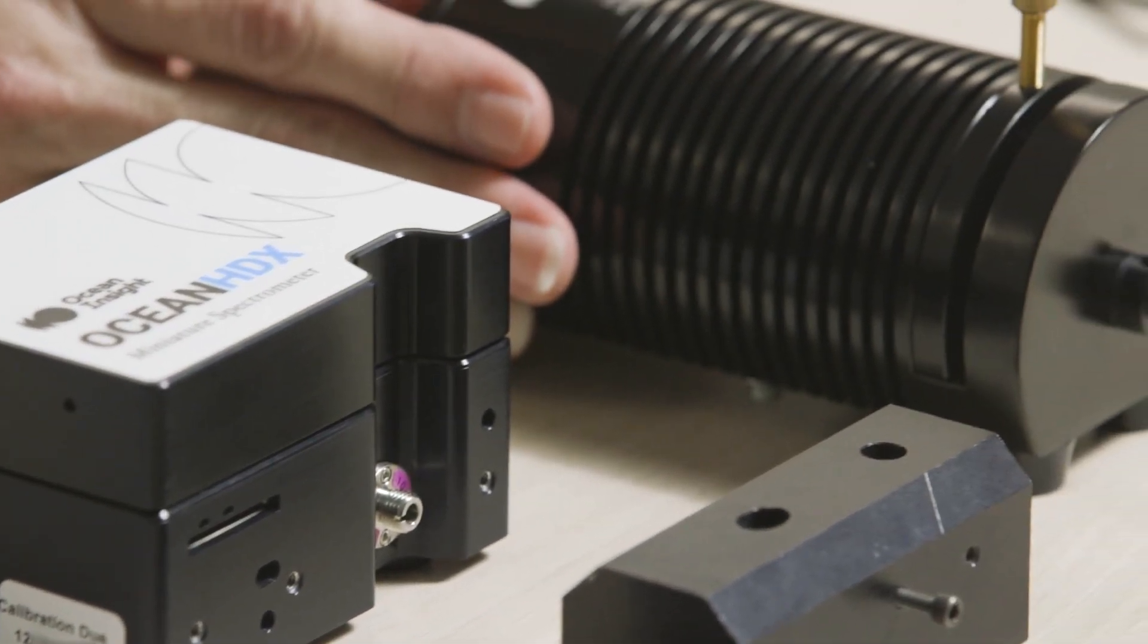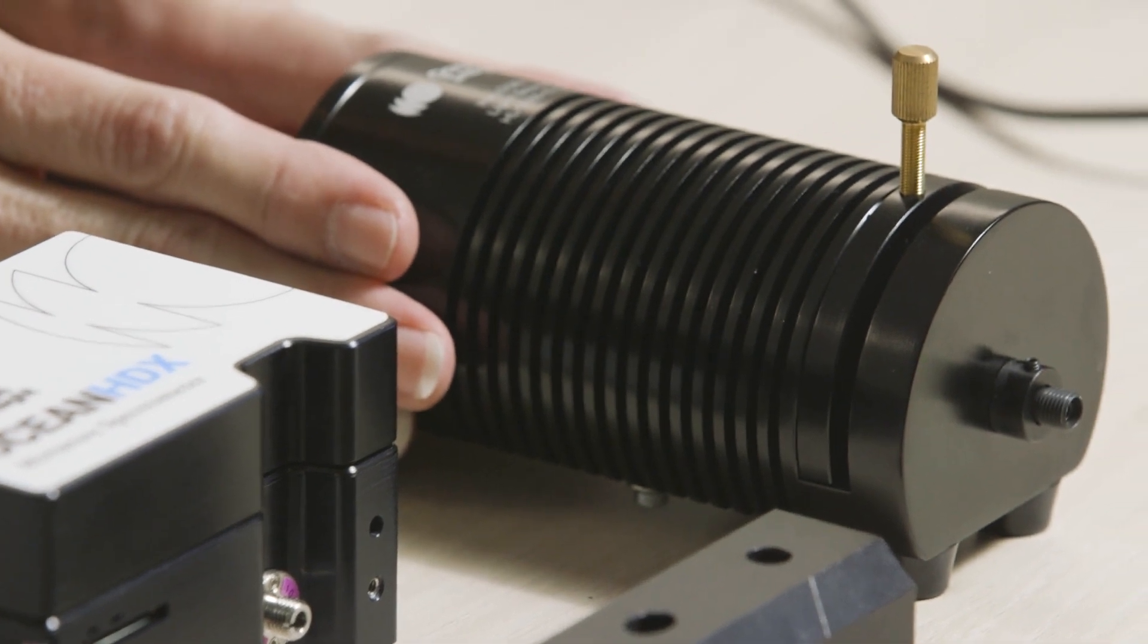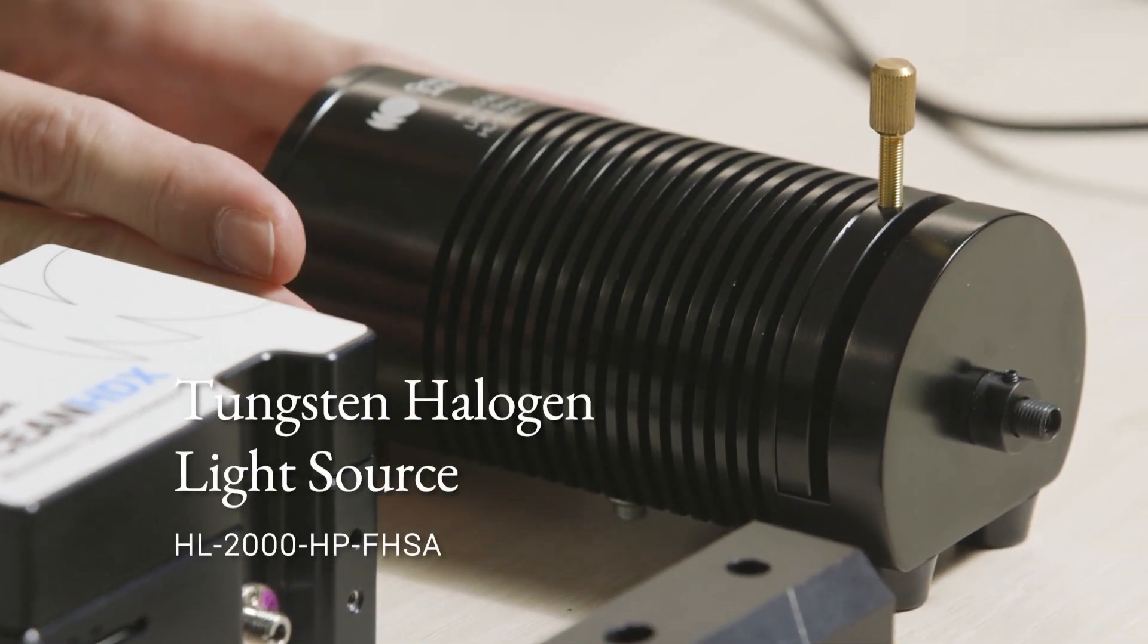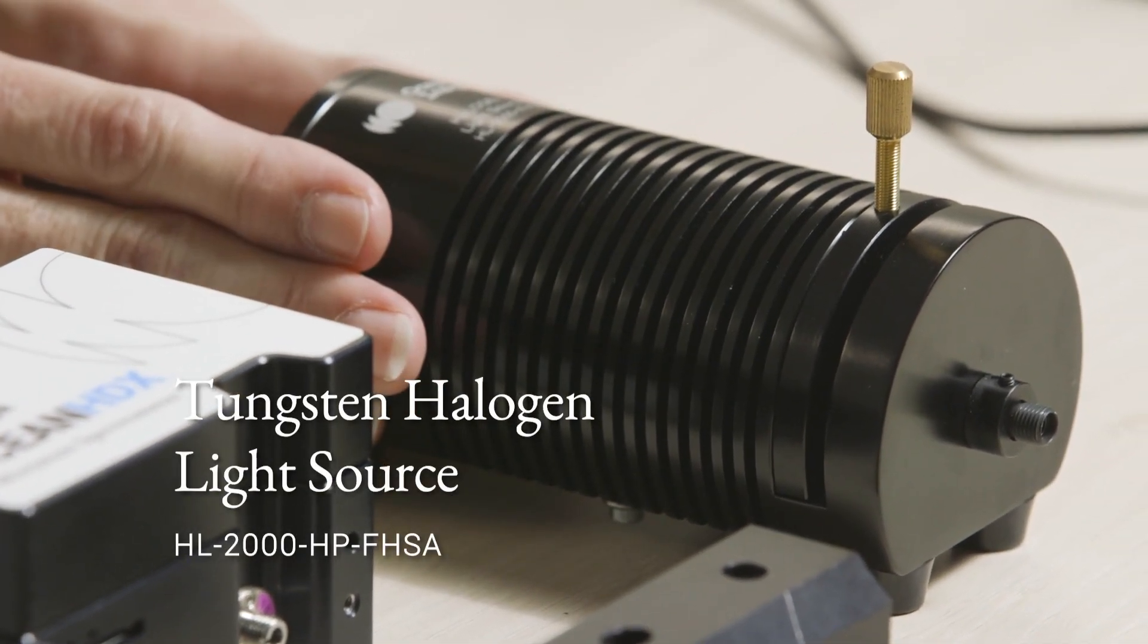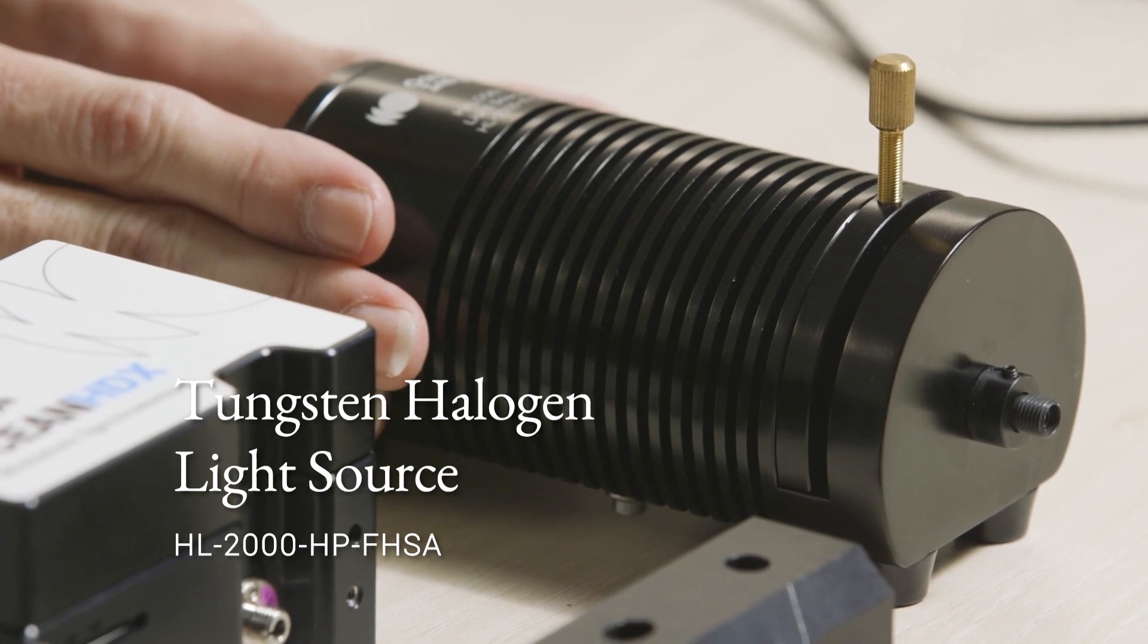We're also using one of our tungsten halogen light sources, the HL2000. This is perfect for those color measurements with lots of energy in the visible and NIR wavelength region.